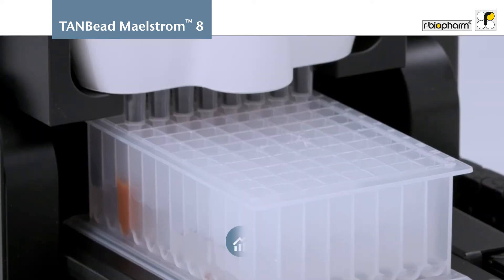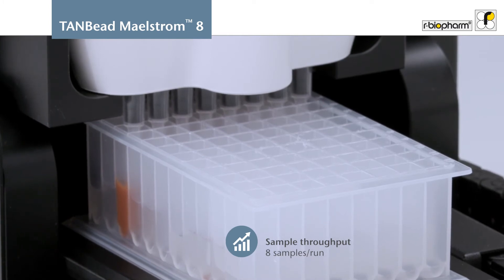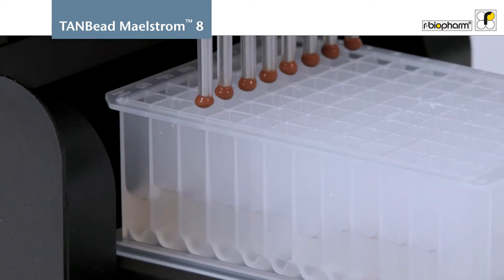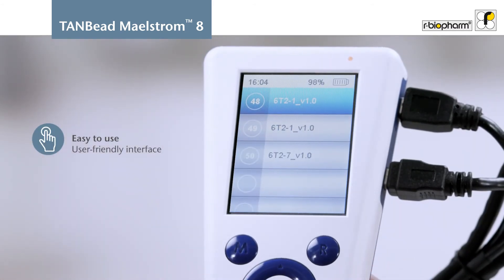The M8 AutoStage is ideal as an entry-level system with low to medium sample throughput, processing up to 8 samples at once. The pre-filled consumables as well as the pre-installed programs get your samples processed quickly and help reduce your bench time.